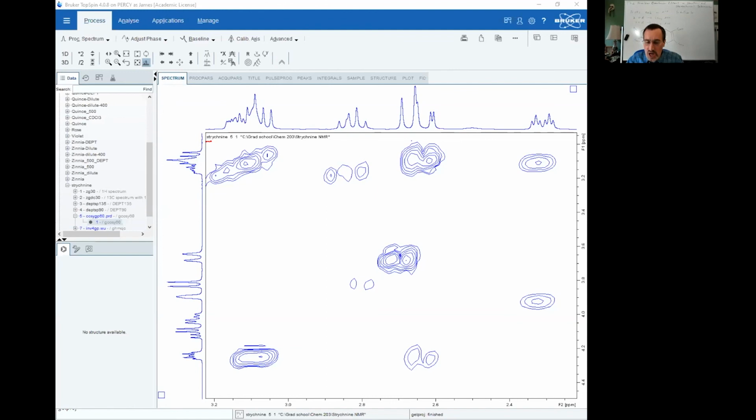One of our jobs when we try to make up spectra, or try to make up problems, and of course, when you make up your spectra in your dissertation and your research for publication, is to choose your levels wisely in order to come up with a representative spectrum.